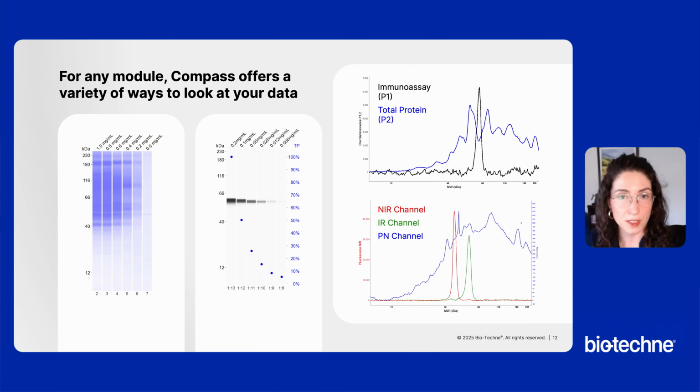Next, we have an overlay of the total protein as a percentage. This is represented as a blue dot over the immunoassay, or the black bands. In this case, we can see the impact of each dilution as a percentage on the total protein dot. The signal decreases from 100%, where the protein load was the highest, to 50 and 25% and so on through the dilution series. That same decrease is reflected in the immunoassay bands as well.